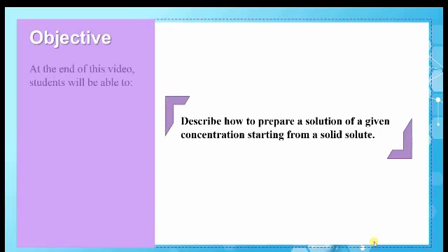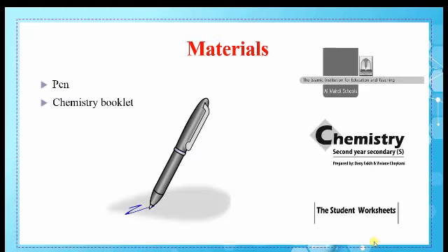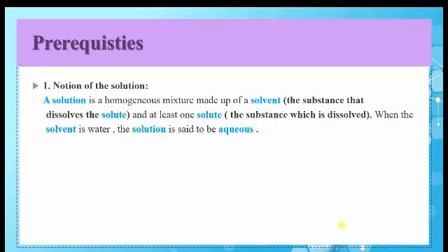At the end of this video, you will be able to describe how to prepare a solution of a given concentration starting from a solid solute. Please prepare your pen and your chemistry booklet. First of all, let's make a quick revision about some notions.